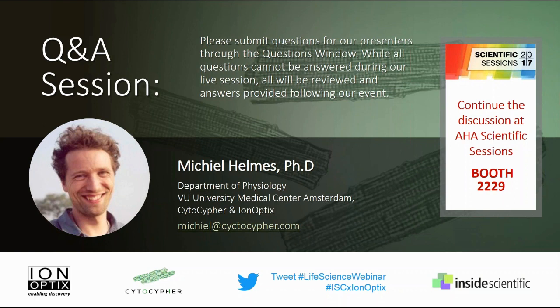Okay, a question from Lily. Is it the case that only a 35 millimeter dish can be used in the system? No, so far we have used two types of dishes. We have used one particular 8-well dish from IBD that works well because without moving anything, we can actually observe 4 wells at the same time. And we're working right now to automate it for a 24-well plate, but we're already doing measurements with the 24-well plates.